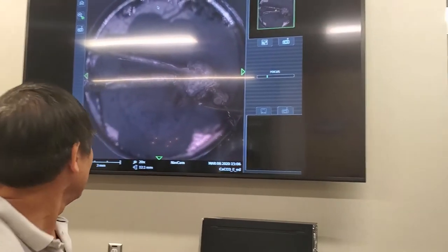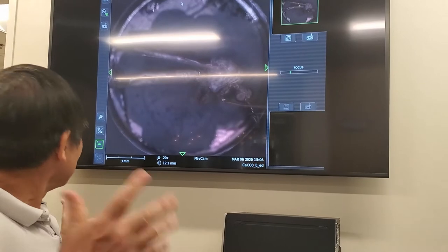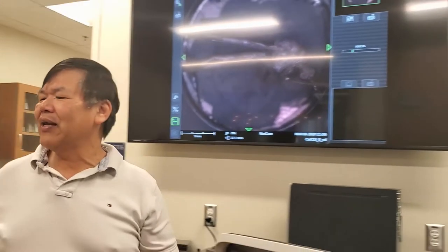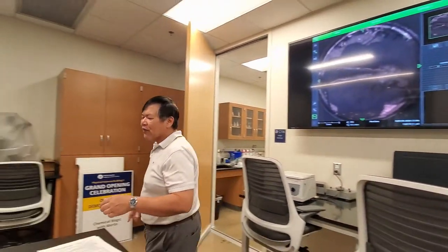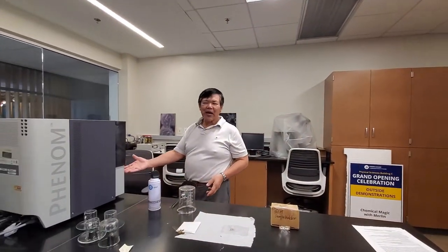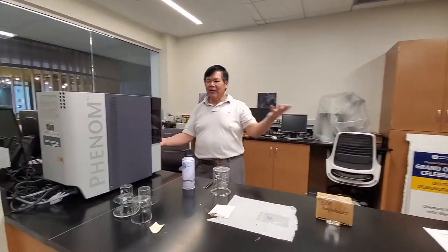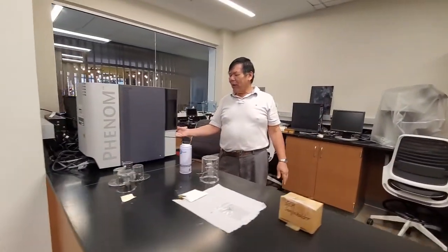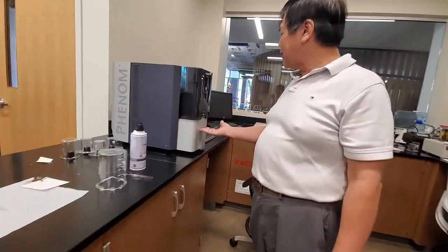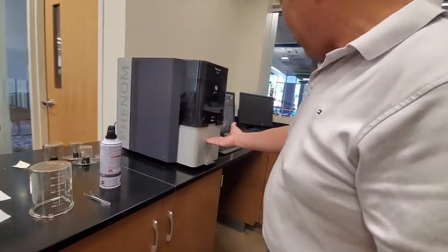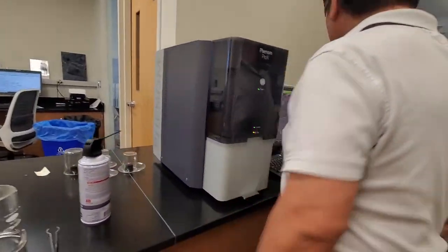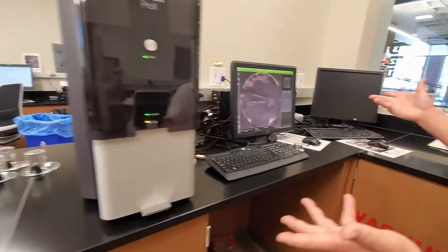So anyway, let's go over here and remind ourselves how to do this. I've already mounted the sample in. I'll show you guys how to do that in a slightly different clip. Now, what's the first thing we need to do? Coming over here.